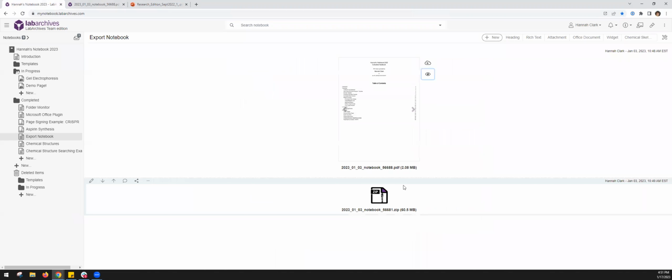The other option here is the offline notebook. So it's going to look like this. It's a zip file, which would download to your local hard drive. It would be offline HTML, pretty easy to work with. It also contains any of your attachments that are under 250 megabytes. So you can go and take a look at that when you need.